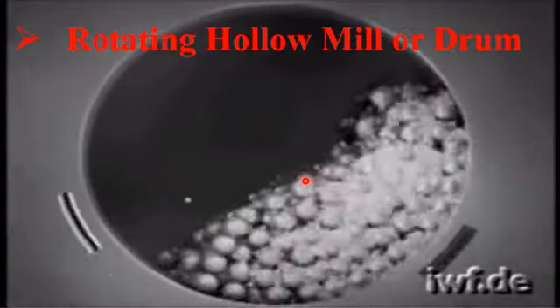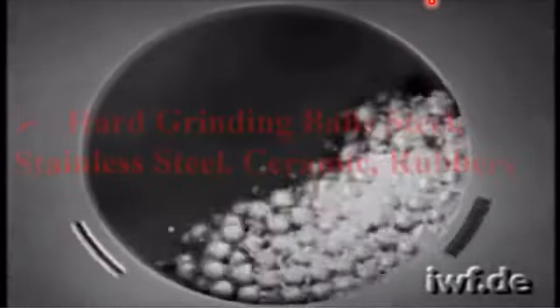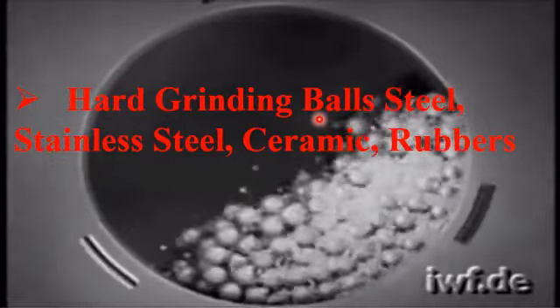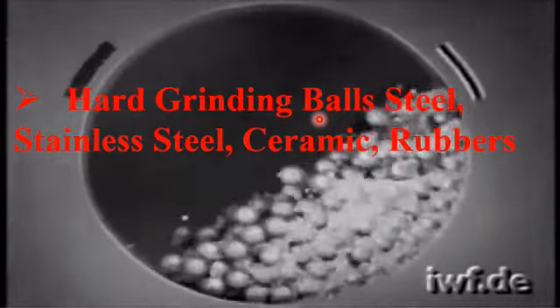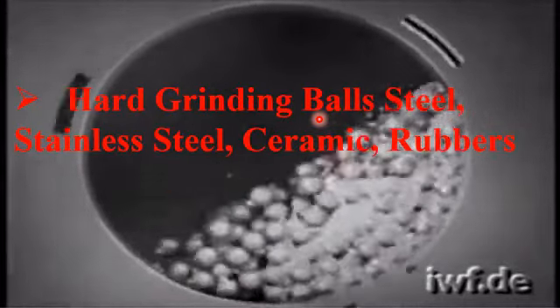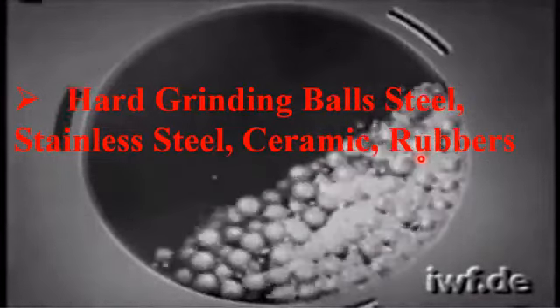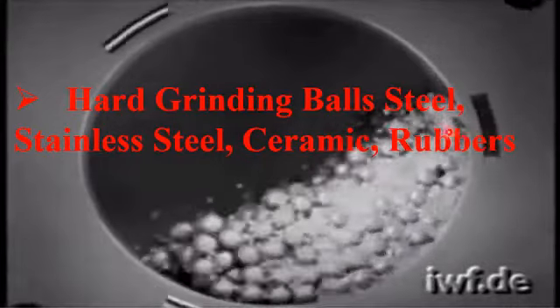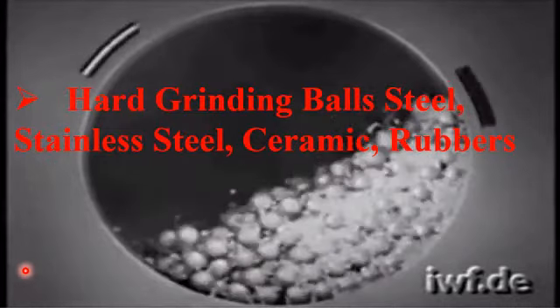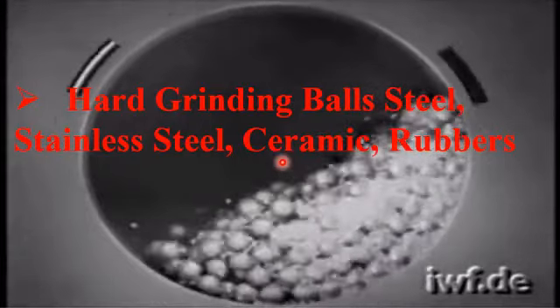The other part of the ball mill machine is known as the hard grinding balls. These hard grinding balls are very important in order to mechanically crush the bulk material. Most commonly used hard grinding balls are based on steel. There are also some hard crushing balls based on stainless steel, ceramics and rubber.